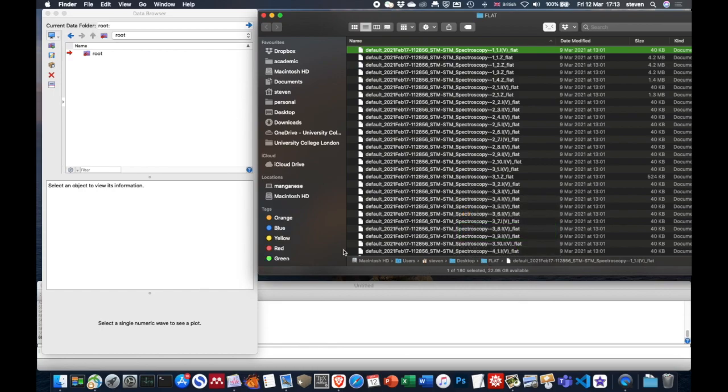so that some of them might have been over the top of a dimer, some of them might have been in the dimer trough, for example, and that would lead to slight differences in the spectra. But for the purposes of this analysis, we're just going to assume that we've got now 51, well, we've got 102 traces because we have got the forward and the reverse trace.